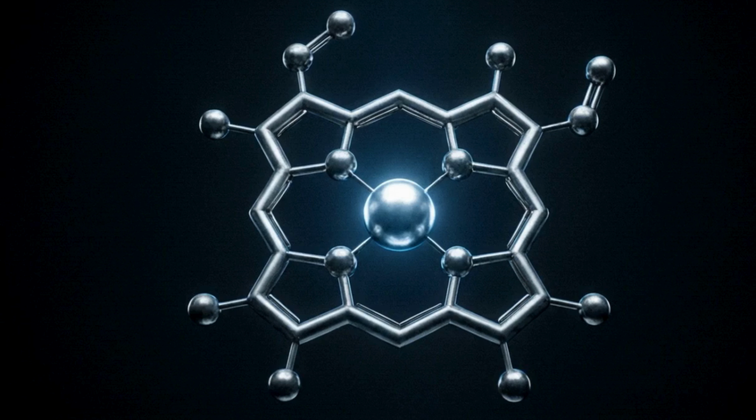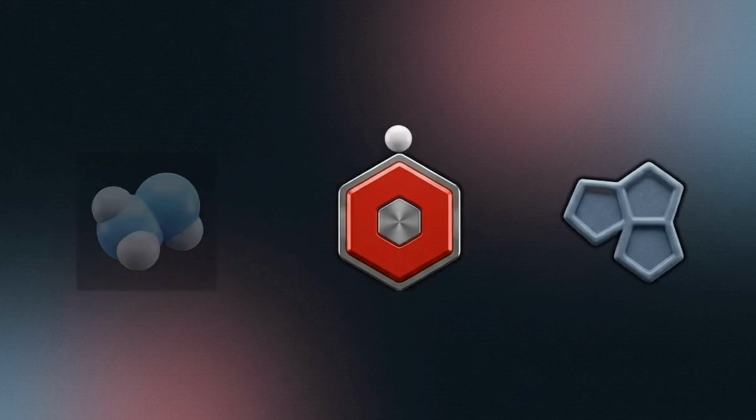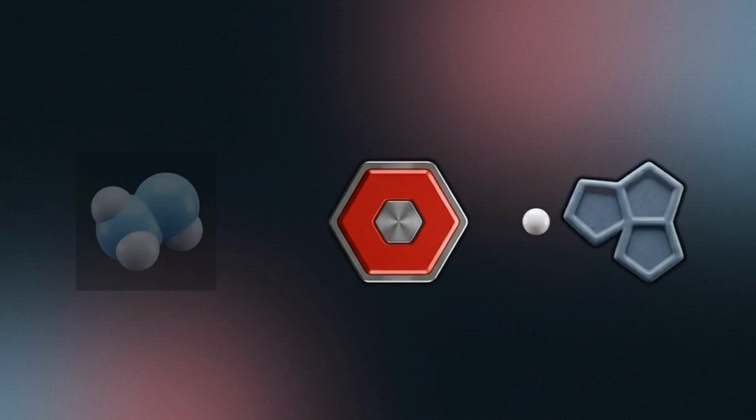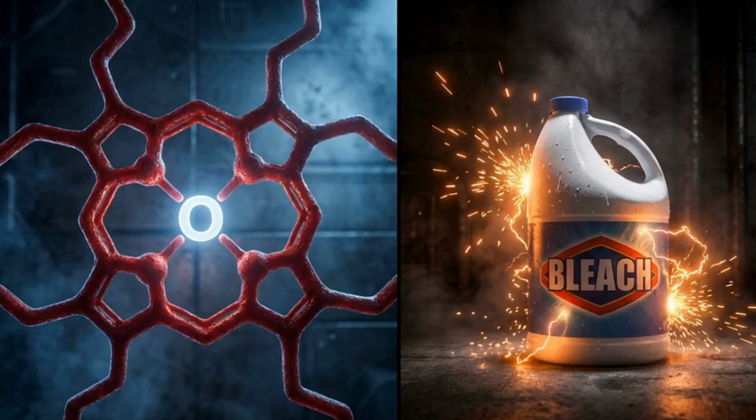This glow is the result of an oxidation-reduction reaction. Blood contains hemoglobin, and within that is a heme molecule holding an iron atom. When the chemical mixture hits the floor, that heme acts as a catalyst. It steals an oxygen atom from the hydrogen peroxide in the spray and hands it over to the luminol, triggering the blue chemiluminescence. But that oxygen theft is also the method's biggest weakness.